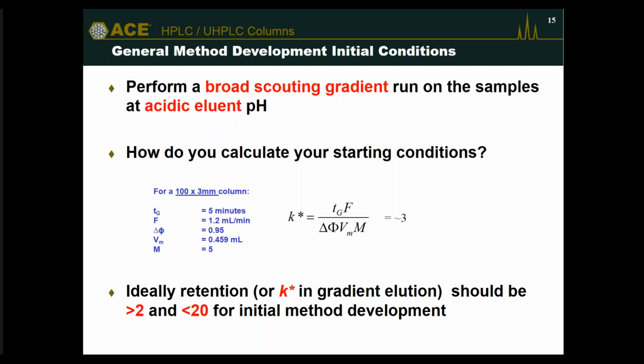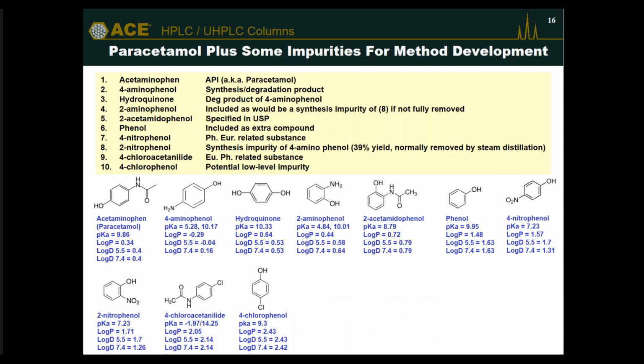So the first example I'm going to show you is a simple example, then I'm going to show you a complex example where we use software. This first simple example is based on paracetamol, which is very well known and very well described. It's been available for many decades now in most countries around the world. Now, it's a very well-known compound, so the structures are well known and the physicochemical data are also very well known.